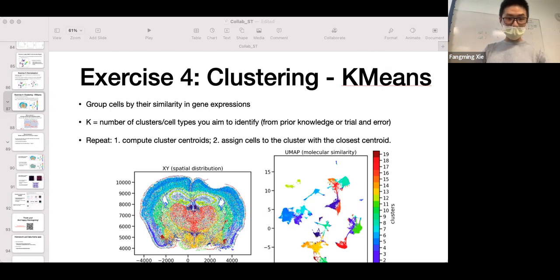Okay. So yeah, now it does show a lot of differences, but because it's so randomly distributed, it still doesn't make much sense. For example, if I ask you, what are the differences between cluster 0 and cluster 1? You can see a lot of genes are different between them, but it's, I guess, less organized than we wanted. Okay, but before we do that, let's change the color map. Actually, changing the color map does show things better, because in this case, 0 is about neutral, about white. And if it's higher than 0, it's red, and lower than 0 is blue.